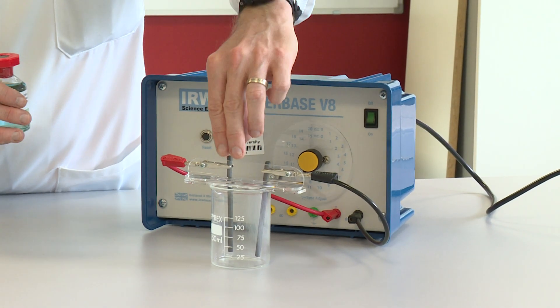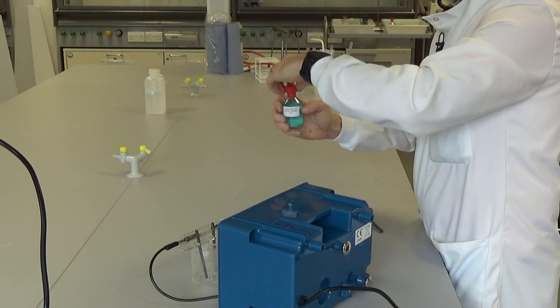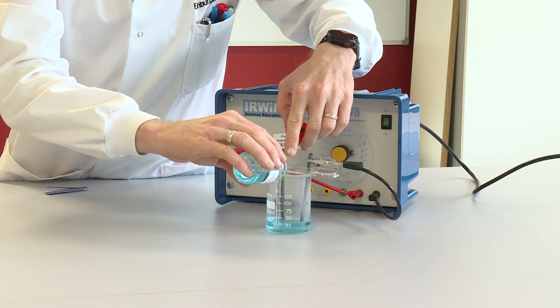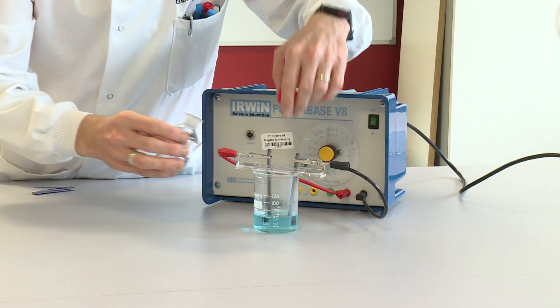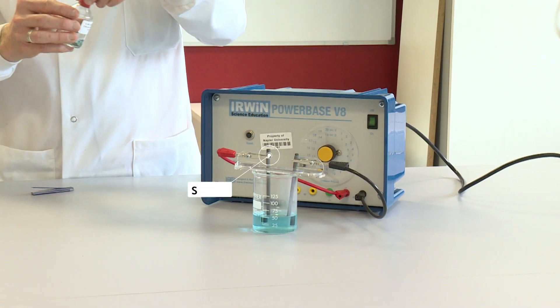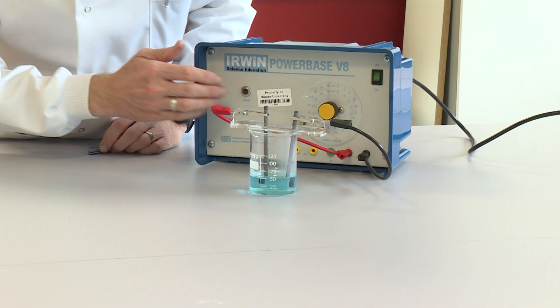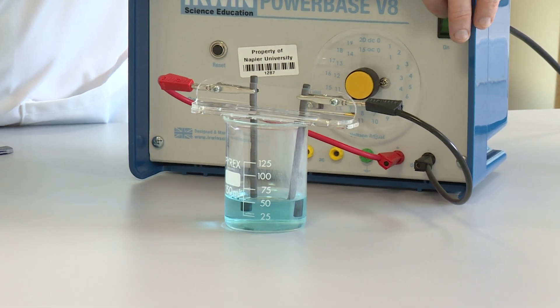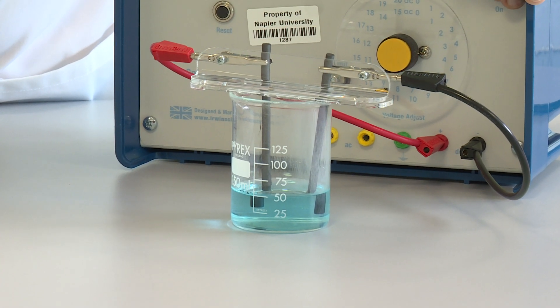I can then add my copper chloride solution to the beaker. You can see copper chloride solution is a blue coloured solution because of the blue coloured copper ions in there. We have the power supply set to 12 volts and I'm now going to turn on the power supply, and we're looking to observe any changes that happen at each electrode.